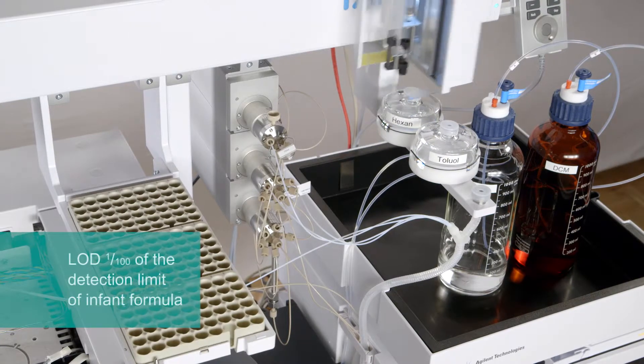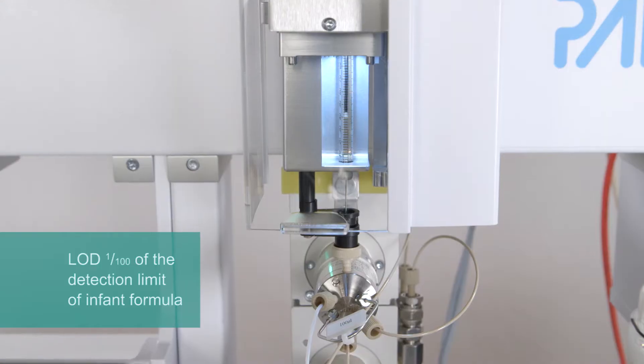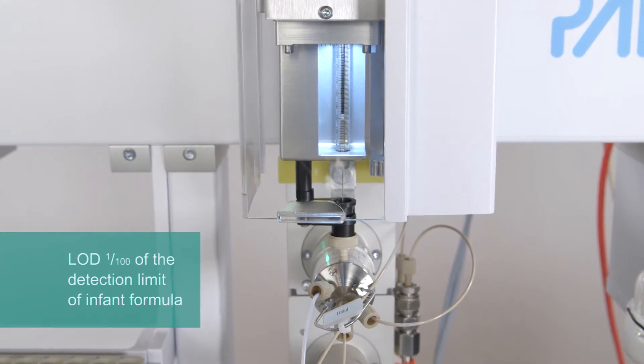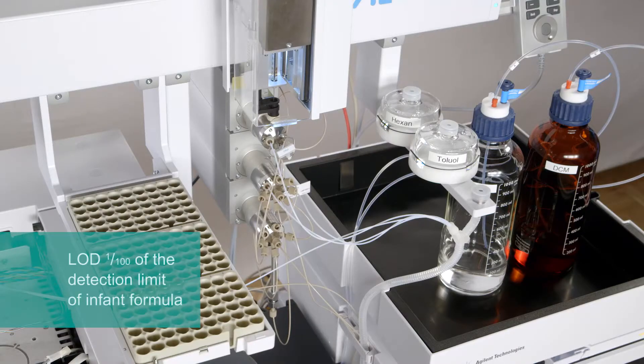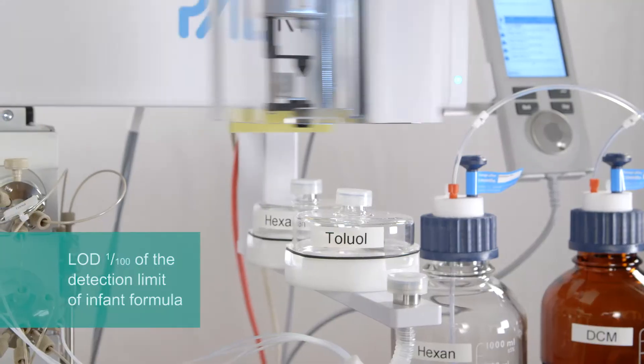With IMPACT, even low detection limits are measured. Detection limits lower by a factor of 100 than recommended European guidelines for infant formula are achievable.